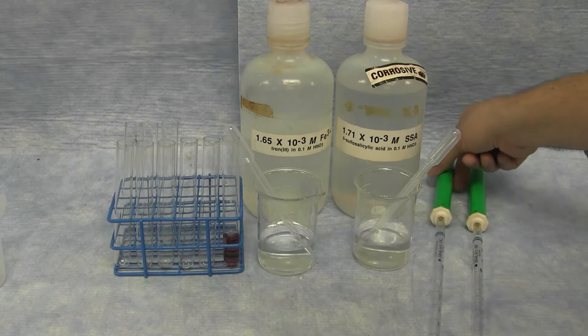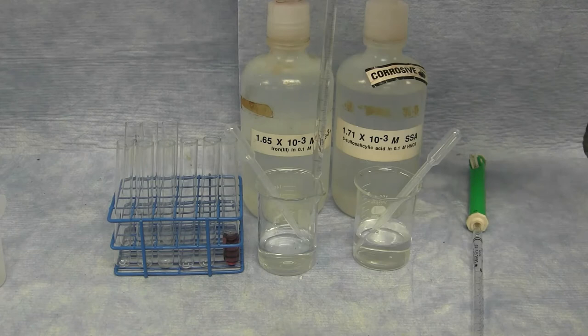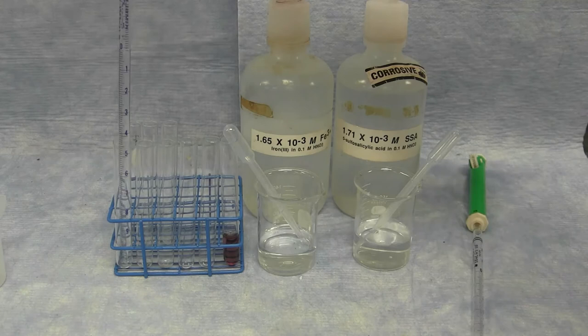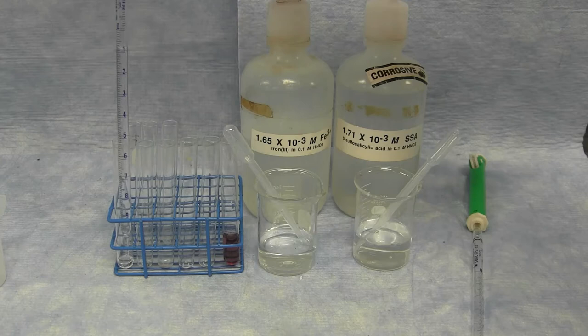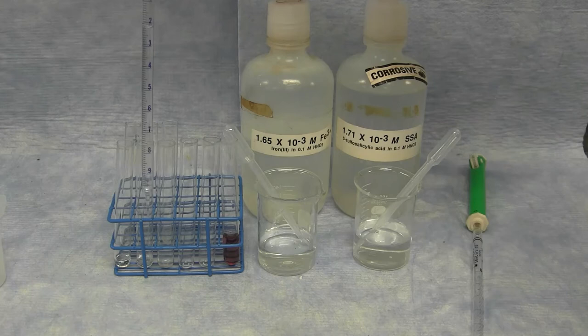Using the pipette, you can draw up a volume and then dispense the appropriate amount. I'm starting at the 0 mark, and I can dispense to the 1.00 milliliter mark. Starting at 1.00, I can dispense 2 milliliters and have a final volume reading of 3.00.